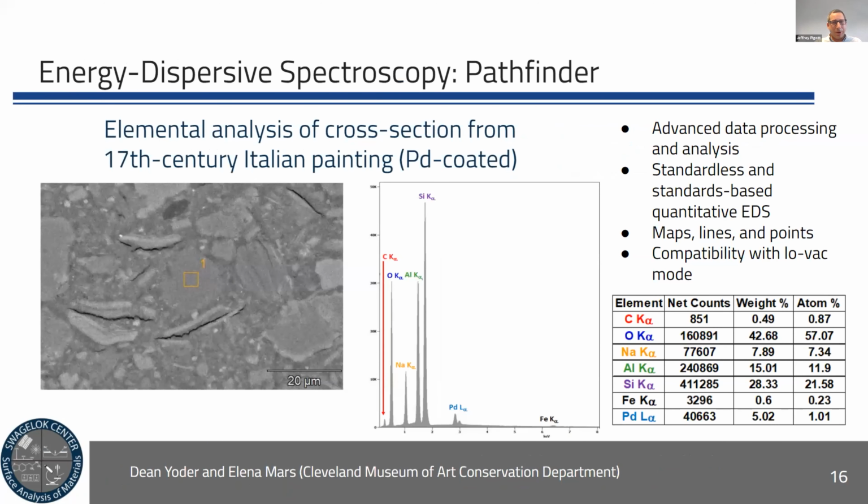In addition to imaging, we can do EDS and we can do quantitative EDS, whether it be standardless or standards-based quantitative EDS using the Pathfinder software. This is an example of some work that I've been doing from a microscopy perspective in collaboration with the Cleveland Museum of Art, where the conservation group is restoring a 17th century Italian painting.